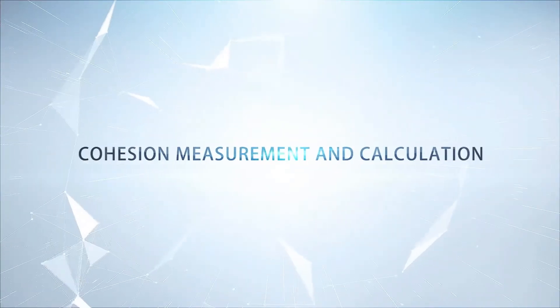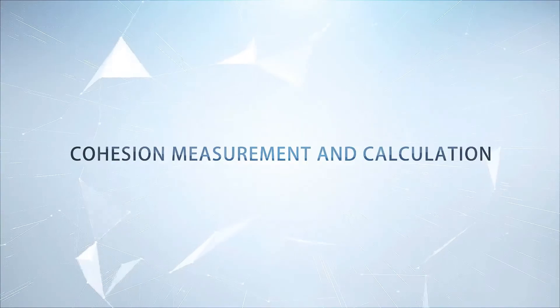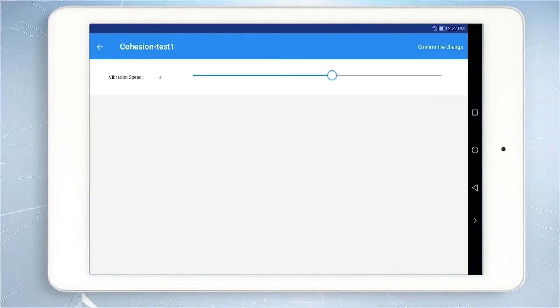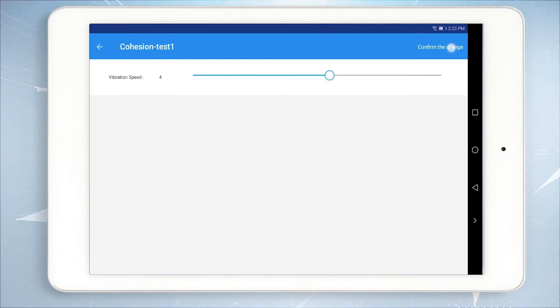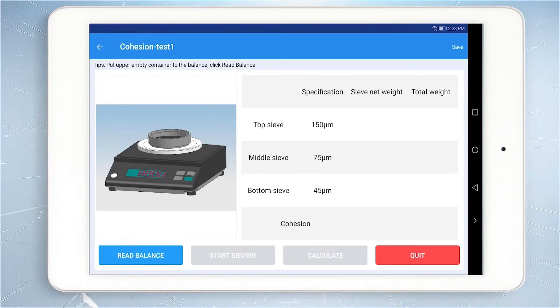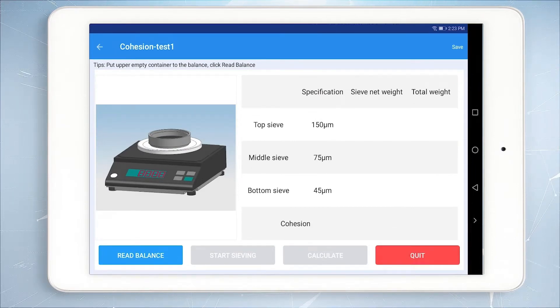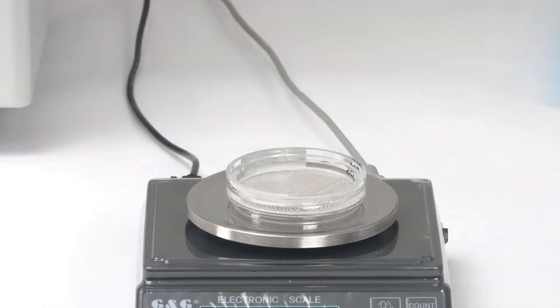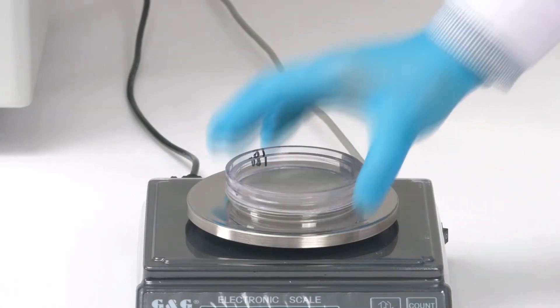Cohesion measurement and calculation: click Cohesion to enter the cohesion measurement. Click Options and set the vibration speed as required. Click Start Measure. The system will give the sieve specification options according to previous bulk and tapped density results, and weigh the net weight of each sieve in sequence according to the operation process.